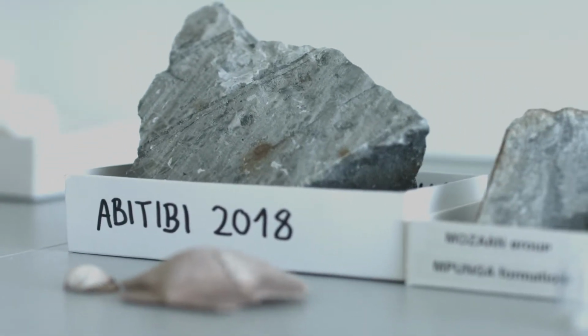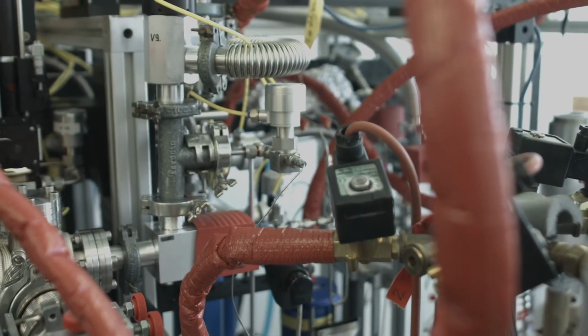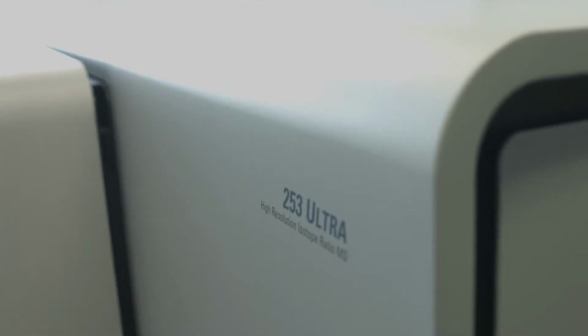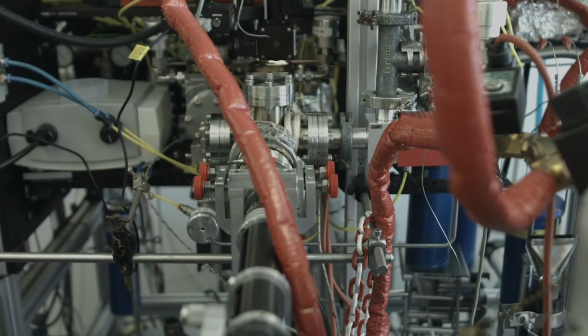We have a total of 3 different gas source mass spectrometers here in our group, and we have 2 conventional gas source mass spectrometers with multi-collector Faraday cups for measurement of the 3 oxygen isotopes on O2 that we release from different materials. And we have a new high-resolution gas source mass spectrometer where we can separate isobaric interferences, meaning that we can separate, for instance, OH from O17. And this is what we use for high-precision measurements of O17 of carbon dioxide.